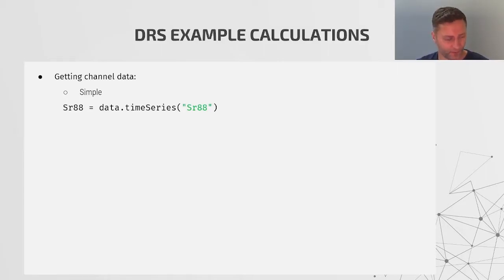For example, on a multi-collector, sometimes the channels are listed by M followed by the mass. Now, if it was strontium-88 as our example, and most of our examples today will be looking at strontium because I've been working on that recently, quite often it's listed by the mass spectrometer as strontium-88. But if it's a multi-collector, it might be listed as M for mass, M88.